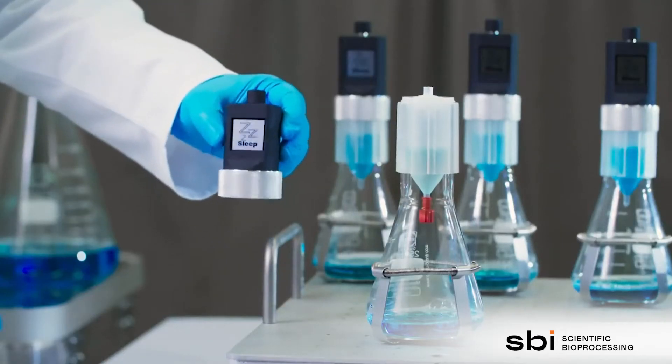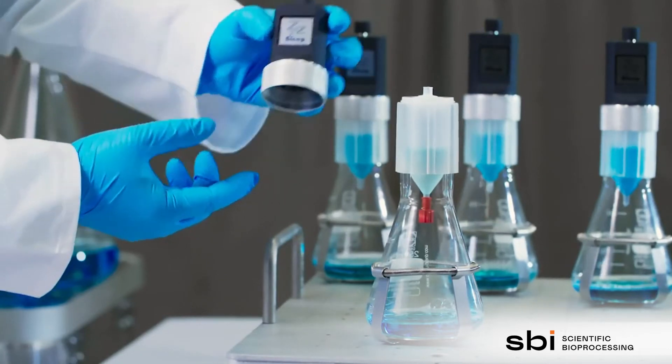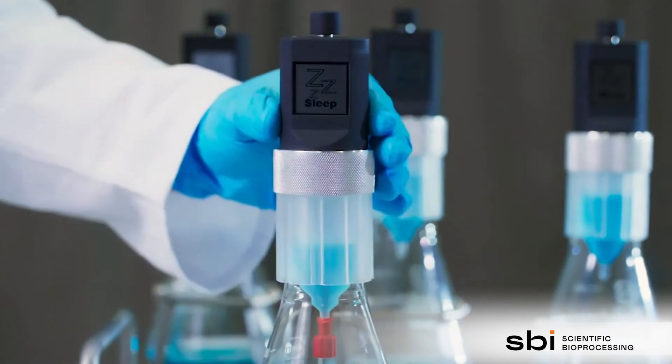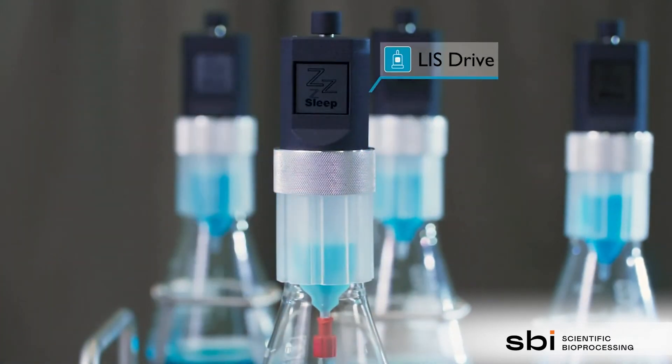Now the drive can be installed on the cartridge. The drive is a programmable miniature pump which controls the feeding of the liquid from the cartridge into the shake flask.